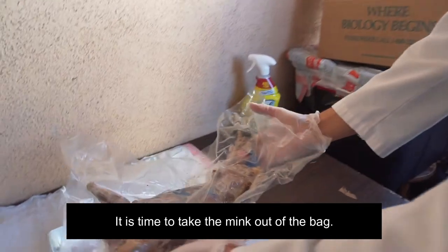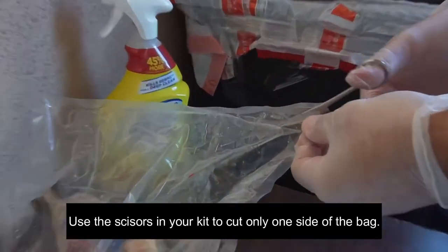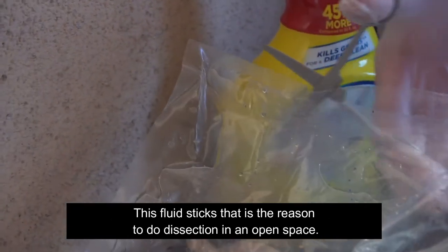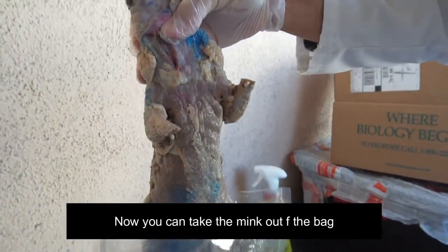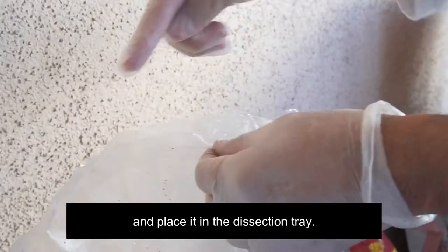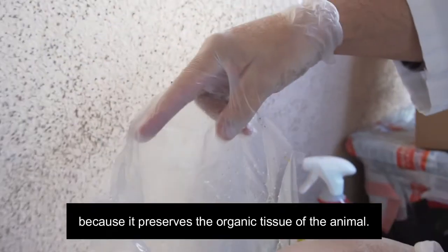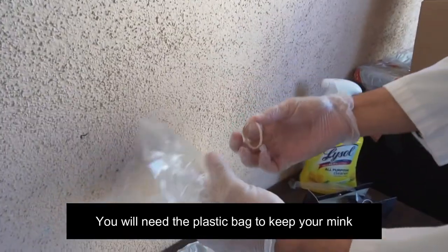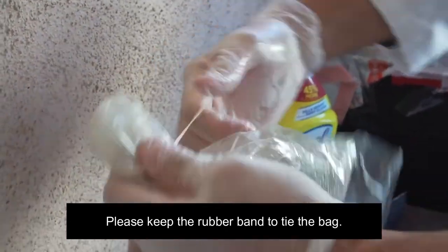It is time to take the mink out of the bag. Use the scissors in your kit to cut only one side of the bag. You will need to keep the fluid in the bag — this fluid stinks. That is the reason to do dissection in an open space and not in a closed space. Take the mink out of the bag and place it in the dissection tray. Save the fluid inside the bag; do not throw it away because it preserves the organic tissue of the animal. You will need a plastic bag to keep your mink for upcoming dissections. Please keep the rubber band to tie the bag.